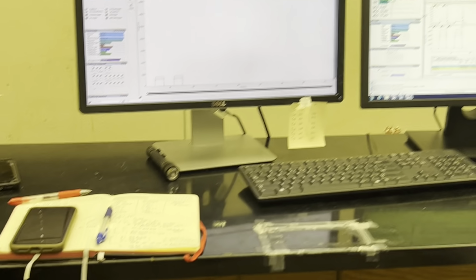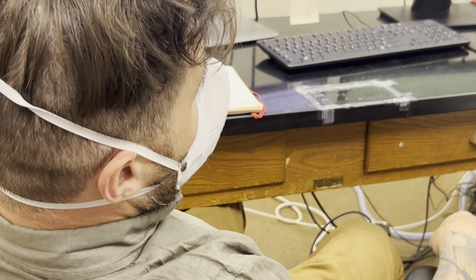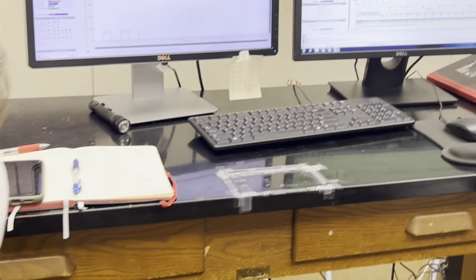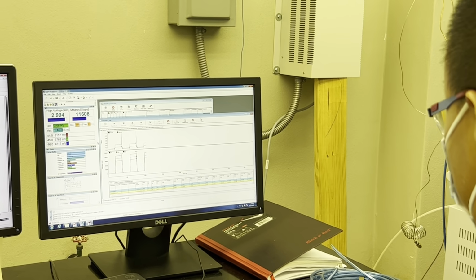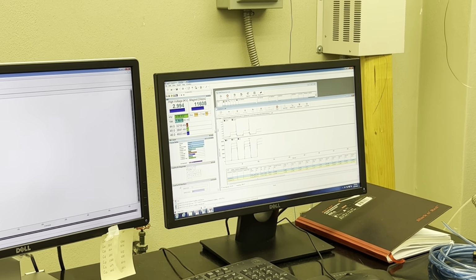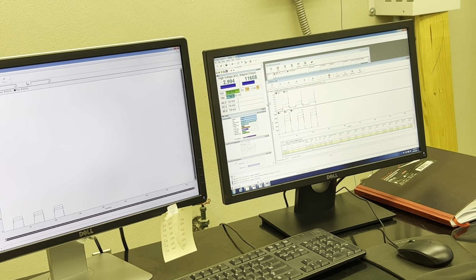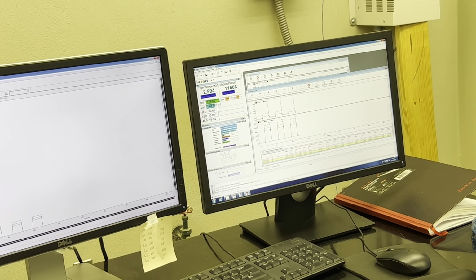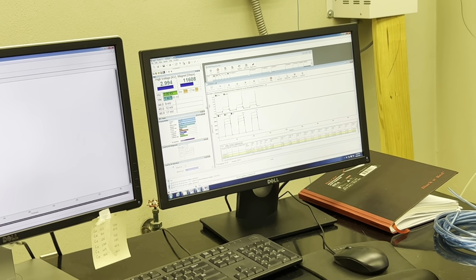You know, it's always going to vary a bit, but I want to make sure that that bake out did something. Yeah, this mass spectrometer was excellent. I mean, that's the old 253. We got pretty similar resolution, and it's pretty stable for these 5 years. But I just don't know the future, what damage might do bad things to the mass spectrometer.